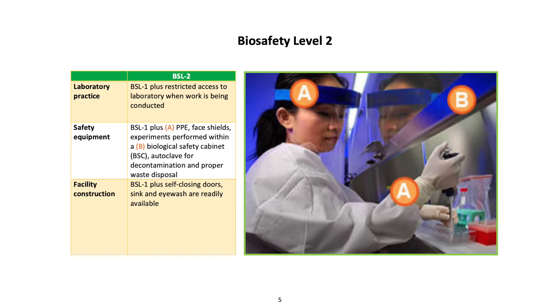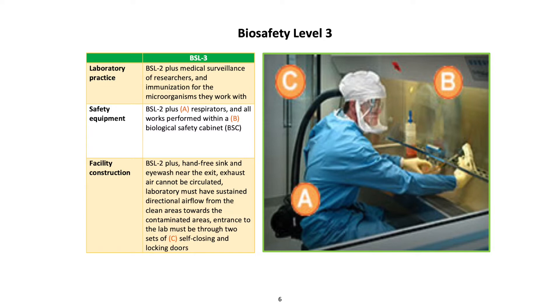BSL 3 laboratory practice: BSL 2 plus medical surveillance of researchers and immunization for the microorganisms they work with. Safety equipment: BSL 2 plus respirators; all work performed within a biological safety cabinet. Facility construction: BSL 2 plus hands-free sink and eyewash near the exit; exhaust air cannot be recirculated; laboratory must have sustained directional airflow from clean areas towards contaminated areas.